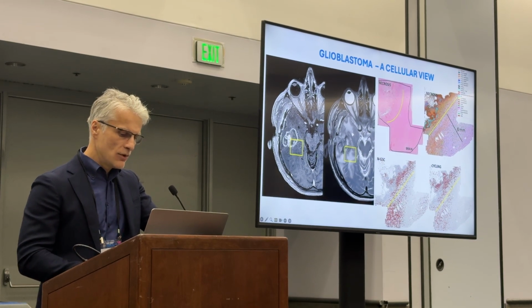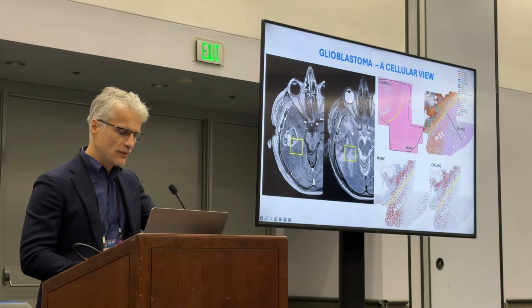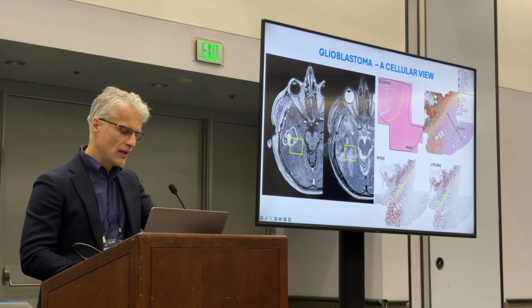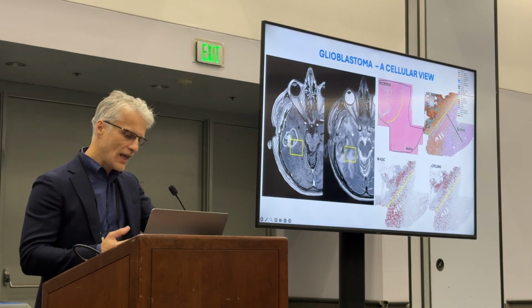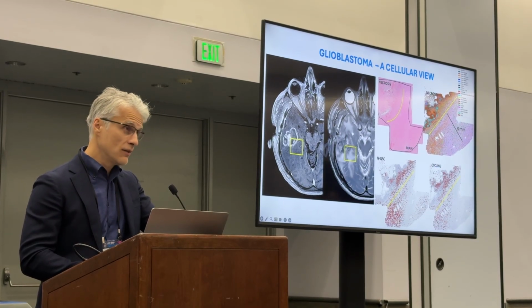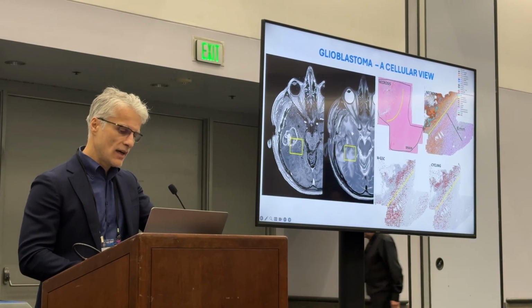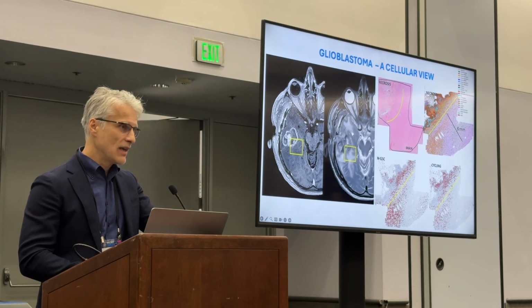The important images for you here are on the bottom. Again, every cell is represented by a dot. I'm highlighting here the transcriptome of cells that are representing glioblastoma stem cells. These are the most active cells in the tumor. They're the ones that are cycling. And here are cells expressing a cycling profile. These are not immune cells, by the way. These are all cancer cells. So in the context of a Rano classified, grade 1 complete resection, this is what remains after surgery.